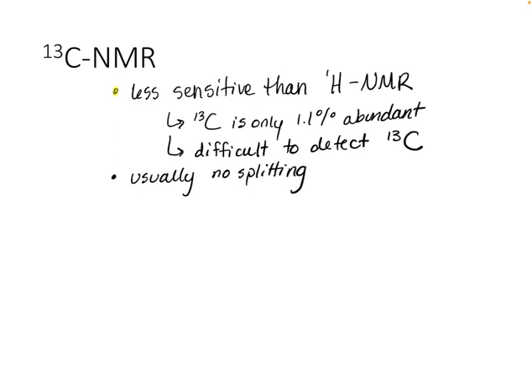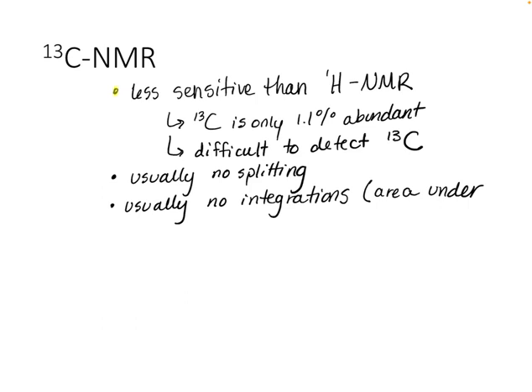And we don't typically integrate the peaks. And that's because the area under a carbon-13 peak isn't really useful.